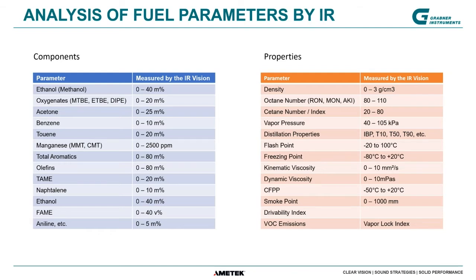So if you look into fuels, be it the diesel fuel, jet fuel, or gasoline, you have really a complex mixture of different hydrocarbons. In spectroscopy, those components which you have there absorb a characteristic part of the radiation and thus can be detected. Among the many parameters, there are concentrations, components, which you see here, and components are typically oxygenates, ethers, aromatics, octane boosters, and other things.